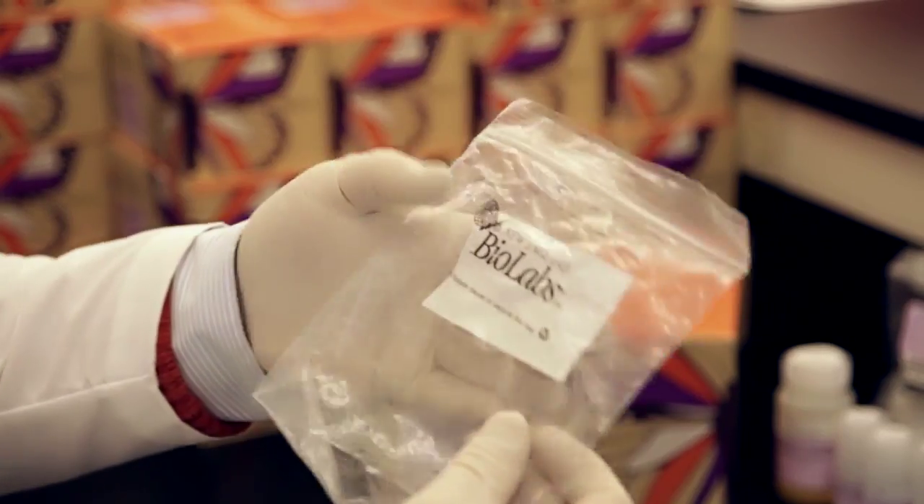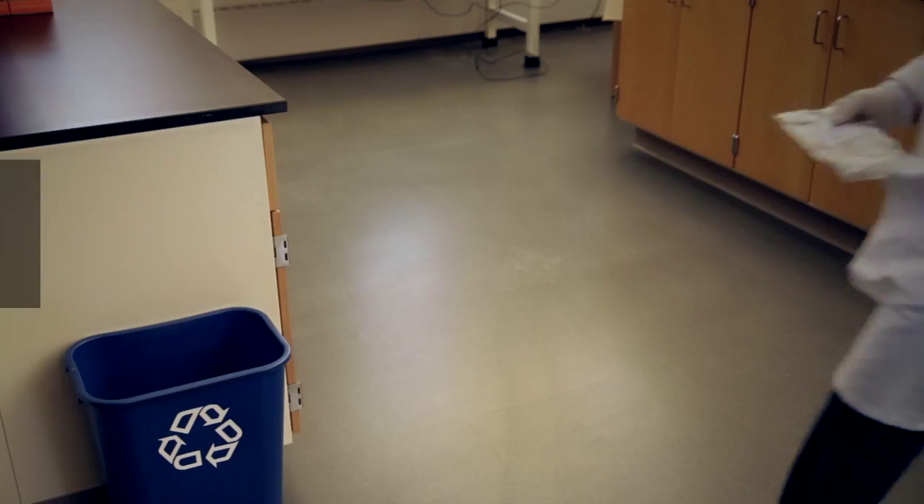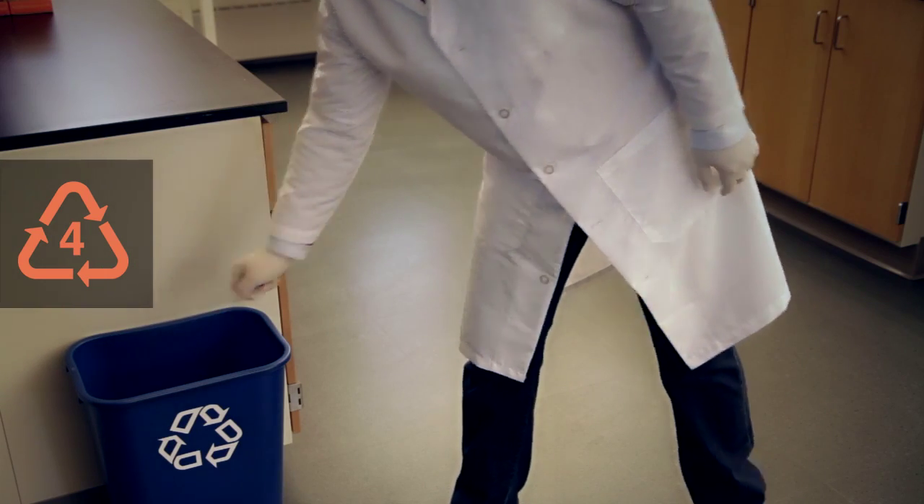The bags containing the columns in the kits are made from LDPE and should be placed in containers labeled number four, which is where other bags like grocery bags and other thin film plastics are normally placed. The label on the bag does not need to be removed.